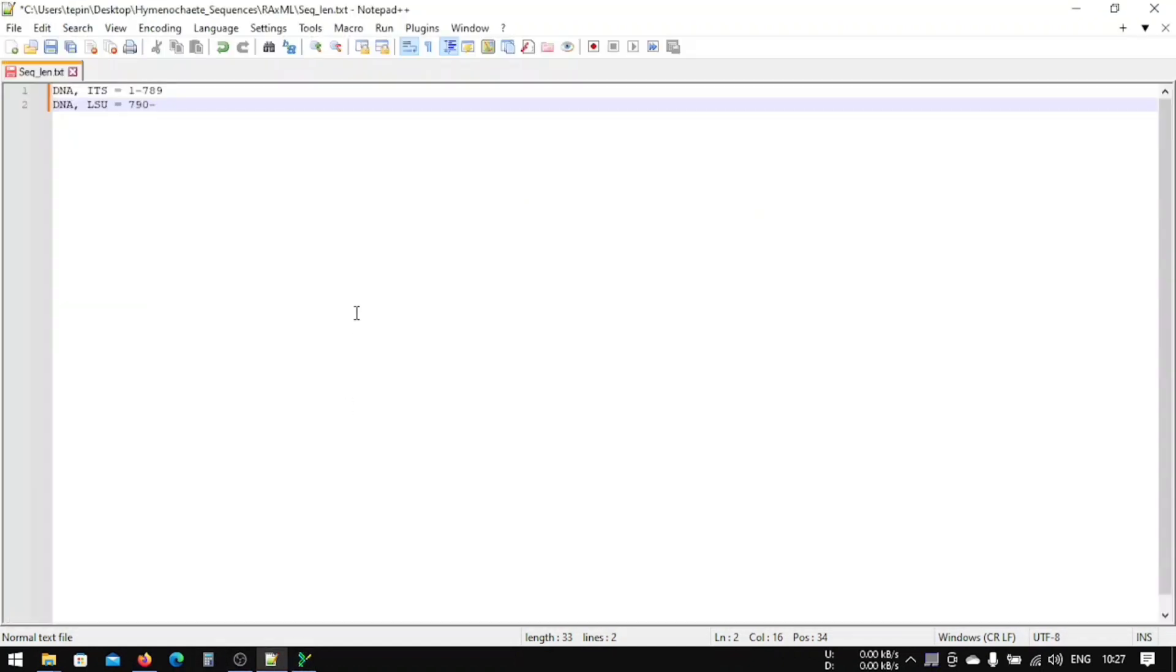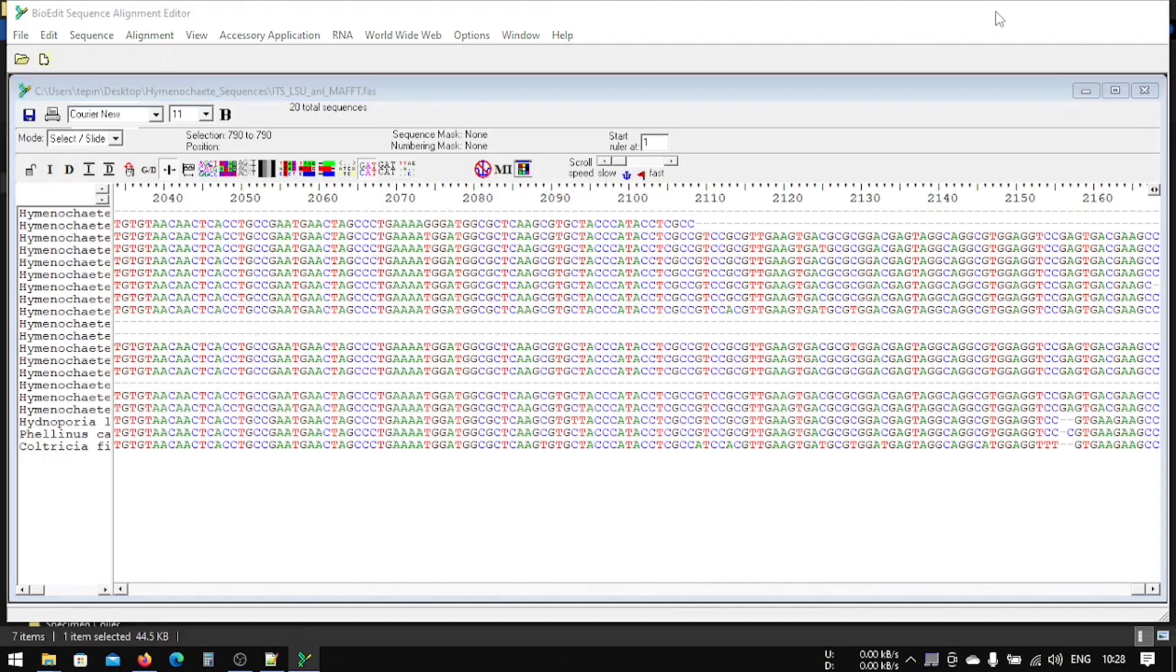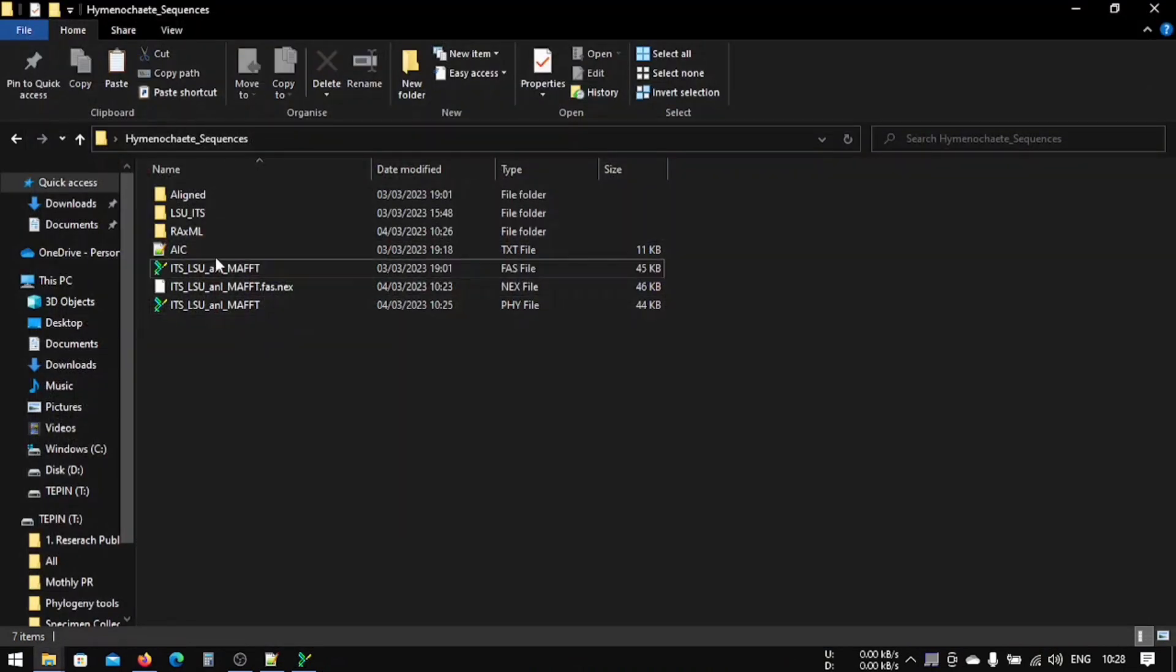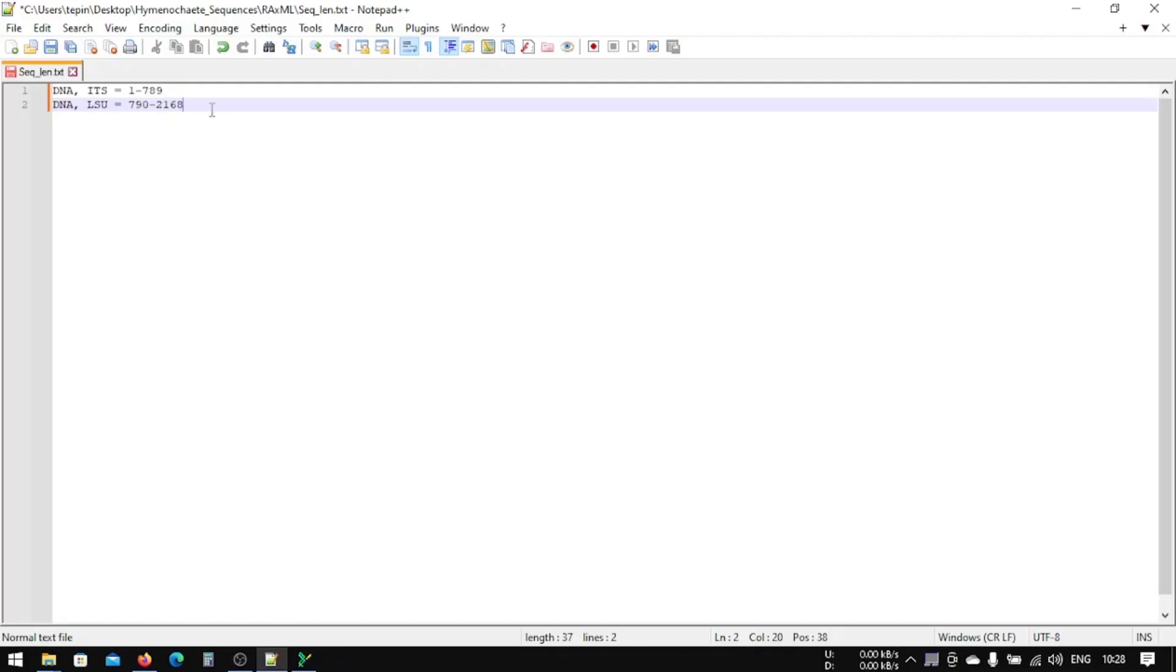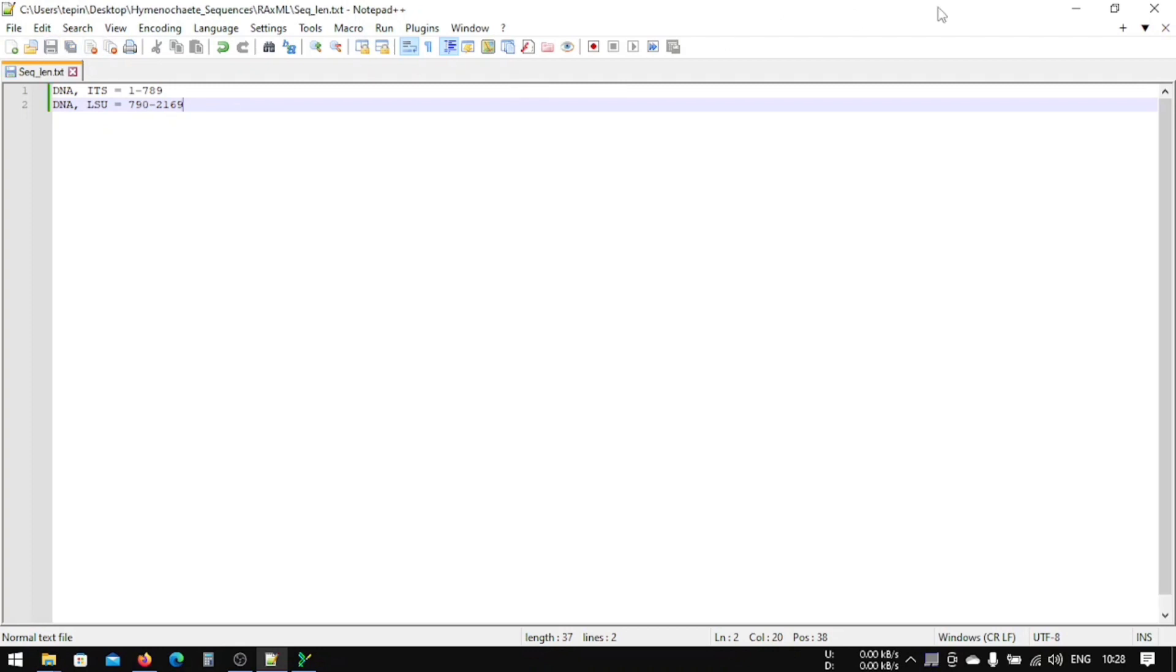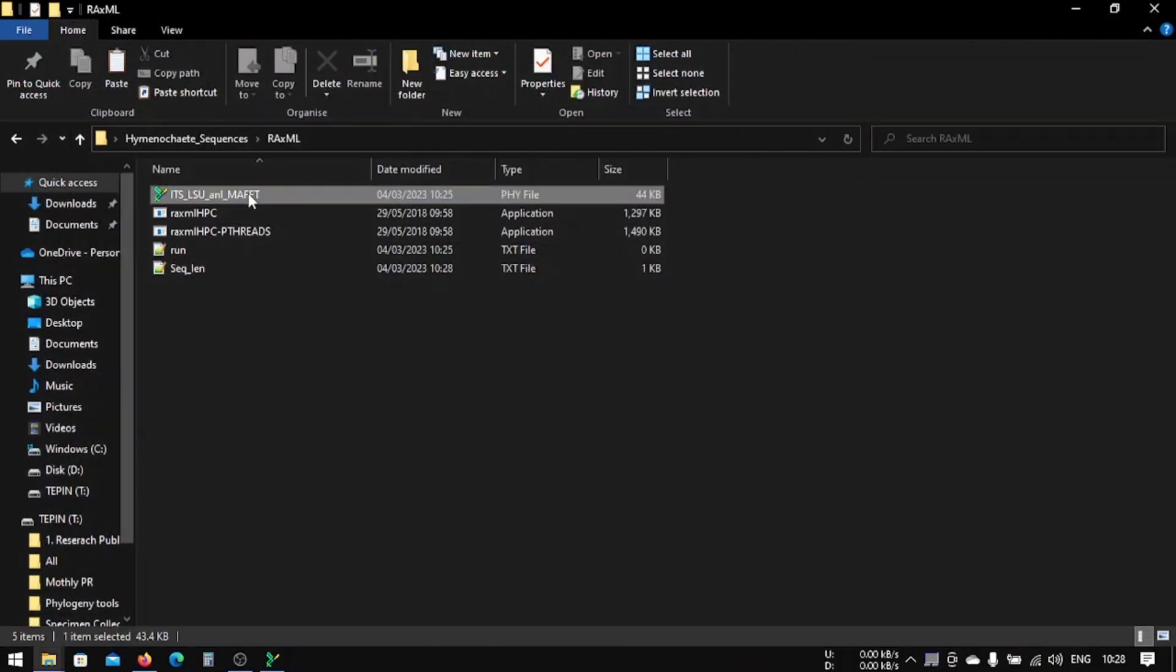2168. And what happens is usually when we transform our file from FASTA to Phylip file using Mesquite, it creates a blank sequence right after the last sequence. So after 2168, it creates another blank sequence, so we have to put that here. That will be 2169, so we will save it.